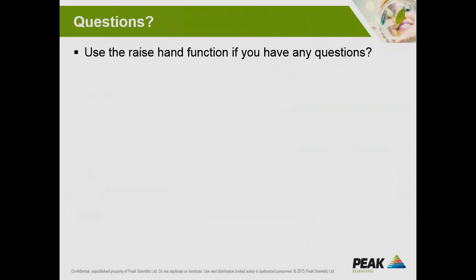Okay. I think that should answer this. Then we have Mr. Praveen Dixit asking, what is the impact of purity of gas on GC analysis?